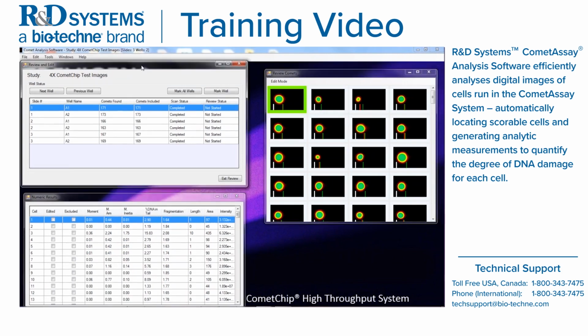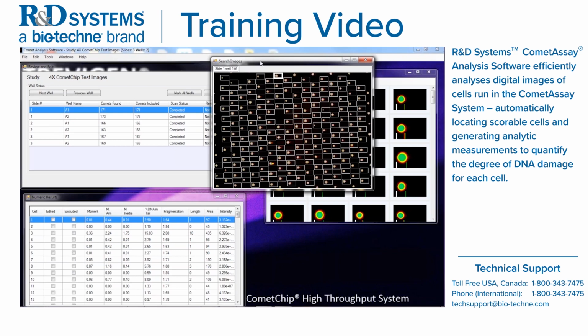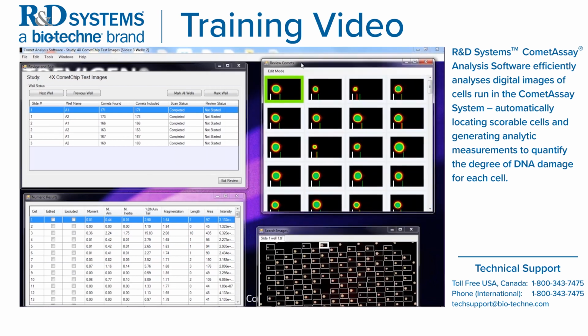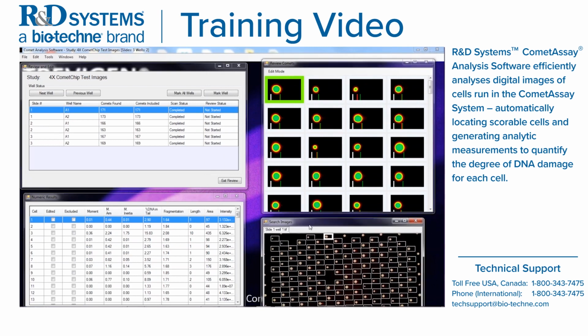There is also, as you noticed in the previous, when we were scanning, the white boxes were being opened up. We'd like to open up those windows also. So go under Windows and hit Activate Search Images. If you have multiple screens, you can move these to your advantage.